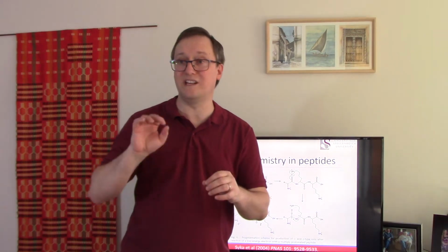Just as you can have a ladder of B ions or a ladder of Y ions, you can also have a ladder of C ions and a ladder of Z ions. That's an ETD tandem mass spectrum. Very popular technique, especially in light of top-down proteomics.